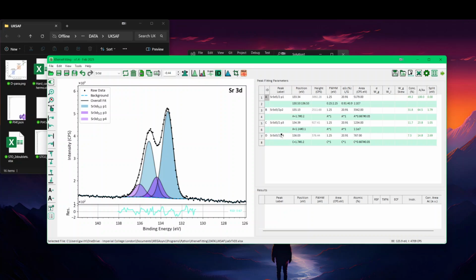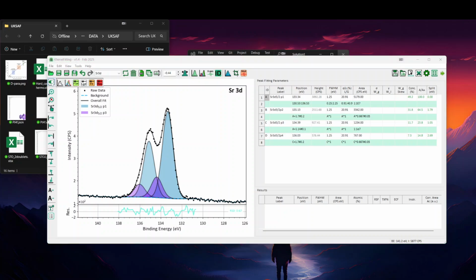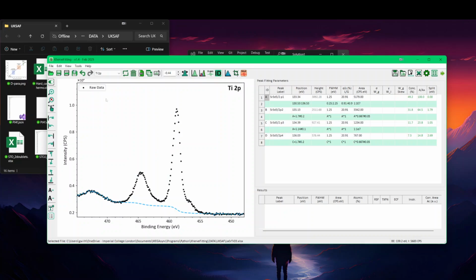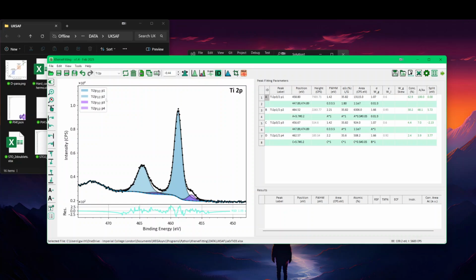You can do the same here. Now it's gone. And if you don't want the raw data, the background, you can go in the toggle menu and just flip between the different modes. So now, sorry, this is the wrong one, the Y label. You can go to the legend, and now you get a more compact legend. And even if you flip between different pages, this will stay.